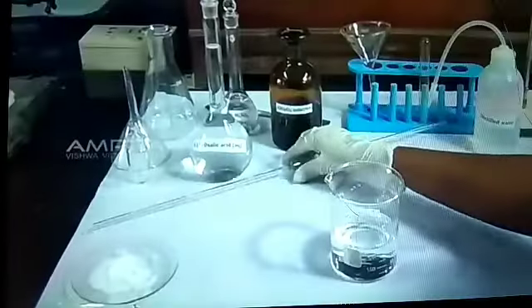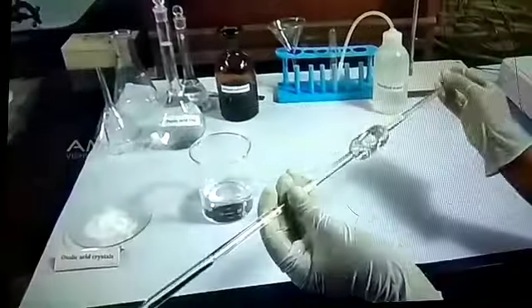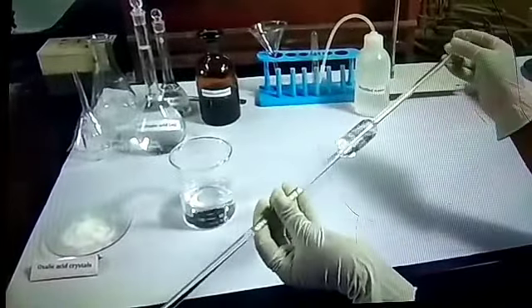Clamp the burette vertically in the burette stand. Take the 20 ml pipette, draw out a small volume of distilled water, rinse it and drain the water.